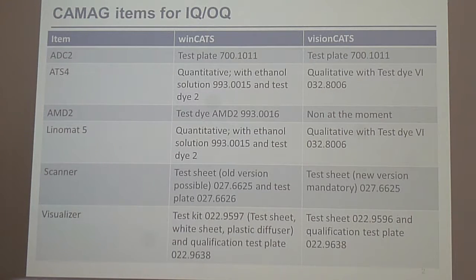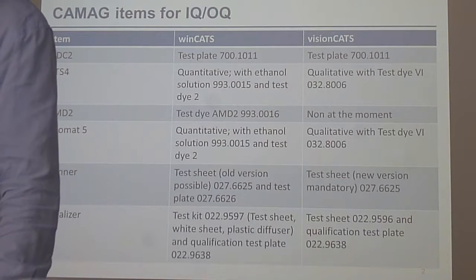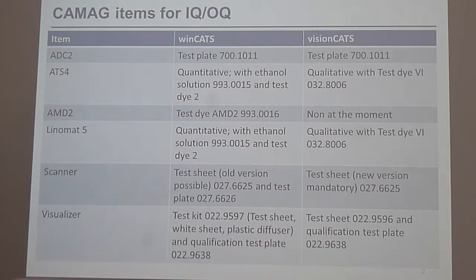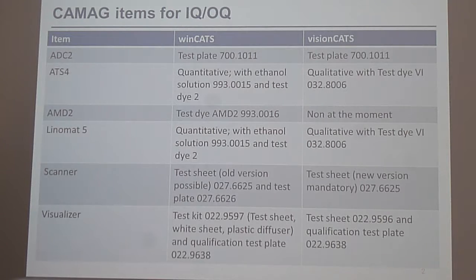One step is that at the moment I can't scan 10 times the same place, because I have to go on at least 1 millimeter. So what we do here is, we scan with an 8 millimeter slit or 6 millimeter slit, we scan each millimeter, to get really close, not to go too far away from the first measurement.